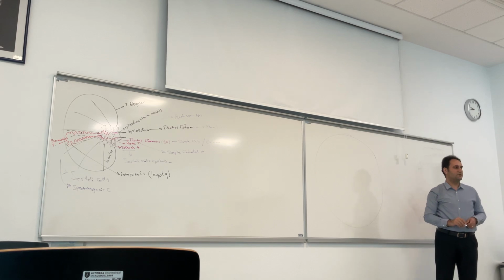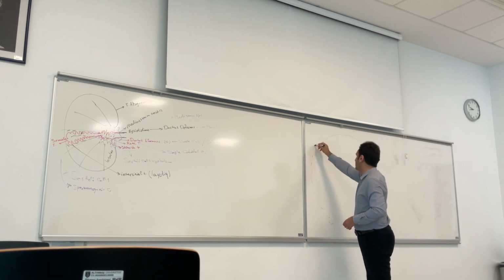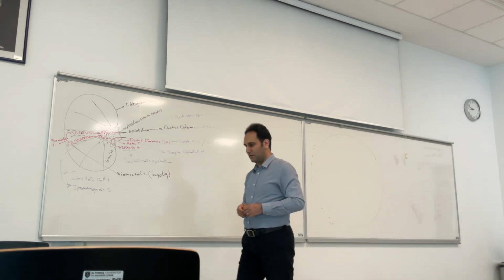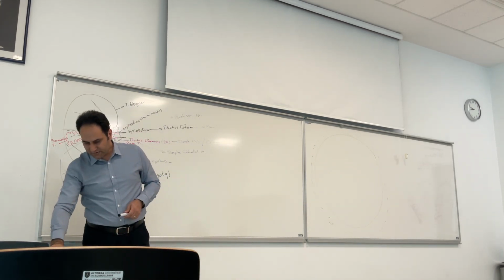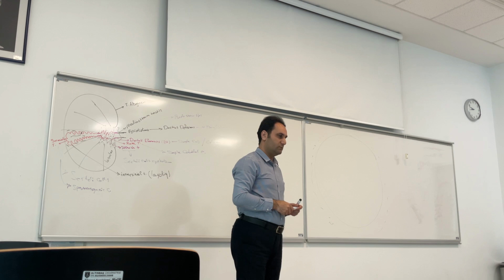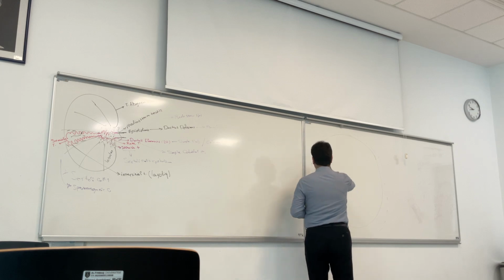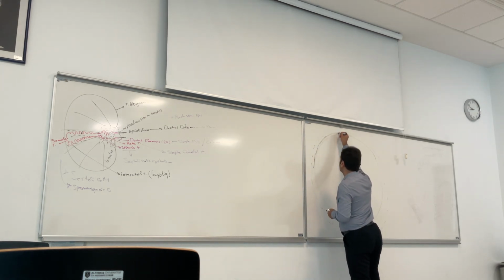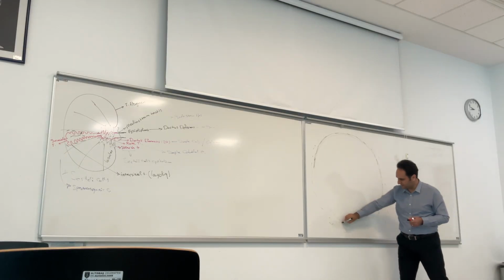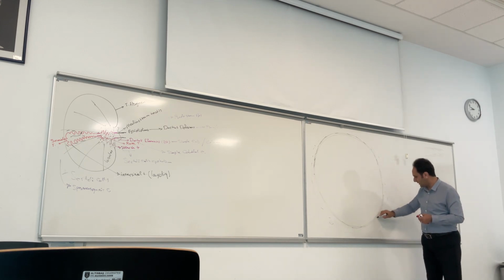This is a section from a seminiferous tubule. On the outer side, we have the interstitial area, connective tissue, Leydig cells and different structures. Each seminiferous tubule is surrounded on the outer side by a type of dense connective tissue. This connective tissue is known as the tunica propria. In some references, they say this is the tunica propria, present in this part.